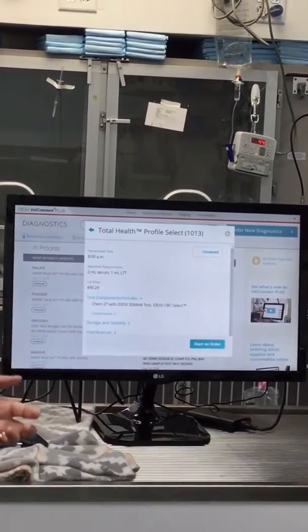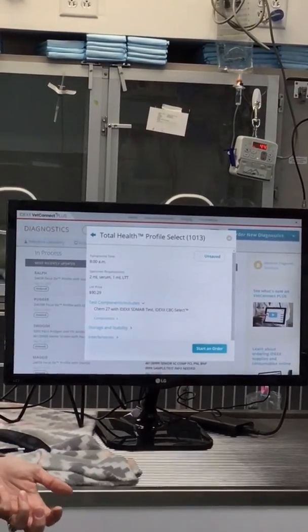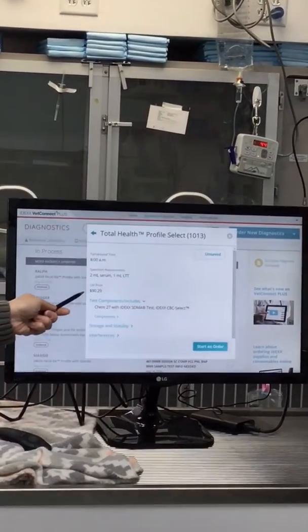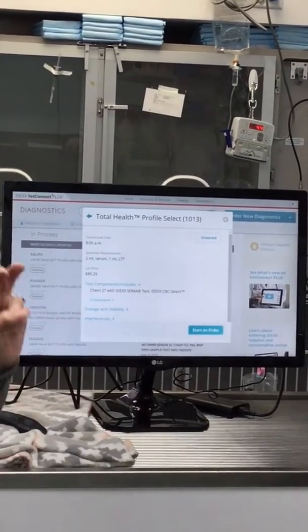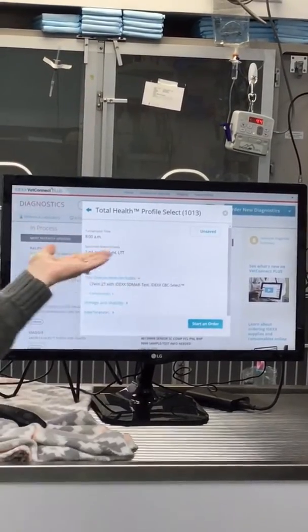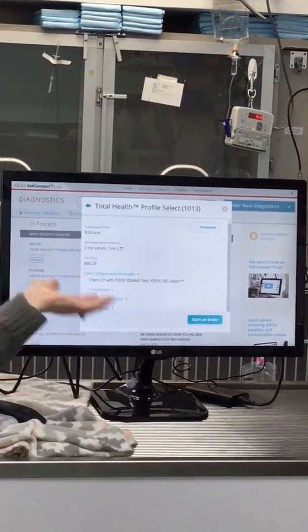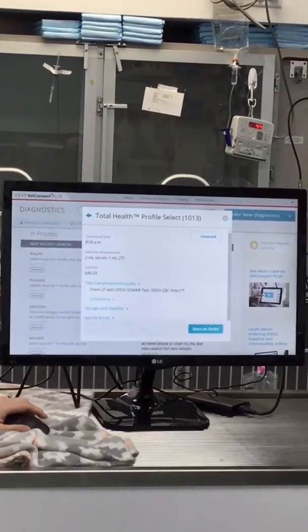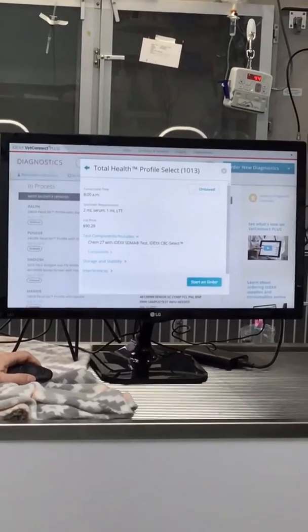Now, there are going to be times where it's 2 o'clock in the morning and you can't reach out to Lincoln to find special pricing. So if you need a guide, this right here is what we call list price. It's like if you went to buy a car, they bump it up and then take stuff off. Same kind of thing. So if you need to know what to charge your owner, this would be a good guide to go off until you get the actual pricing, because sometimes that could be a limiting factor. We have some tests that are like $400, so.